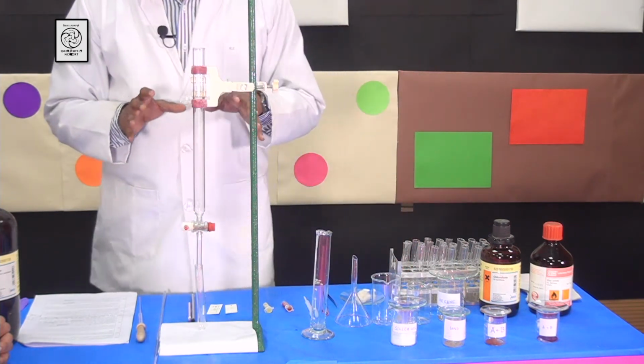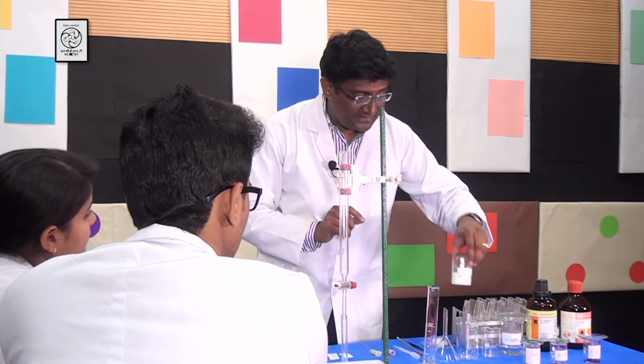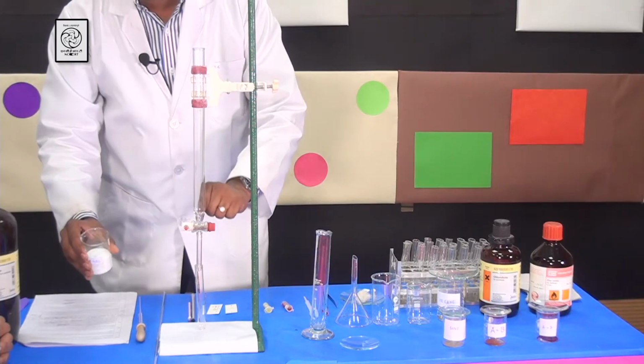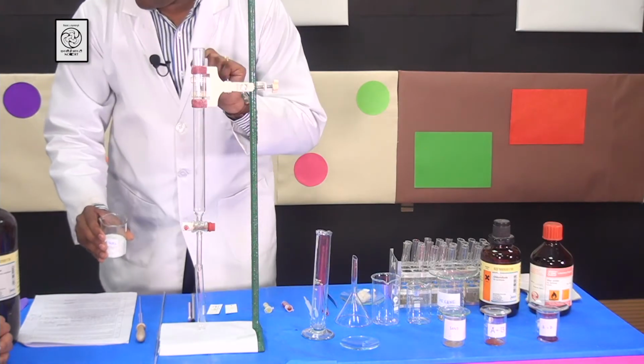Now I am going to load the column, but you can see that silica gel is a fine powder and it will pass through the column. So I have to put cotton at the bottom of the column and press it tightly so that the silica gel doesn't filter through it, and I am going to do it right now.